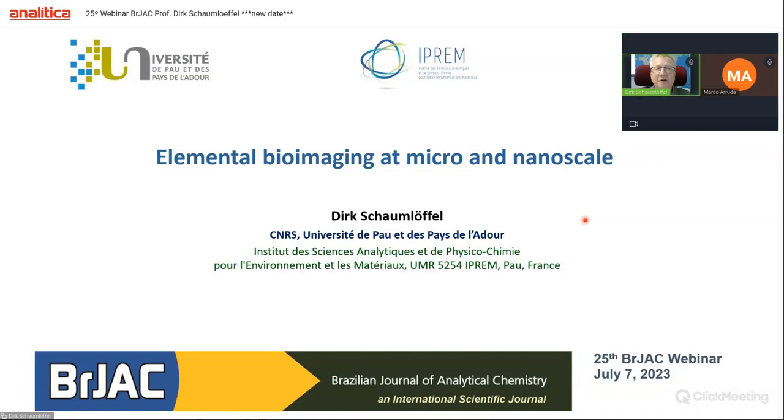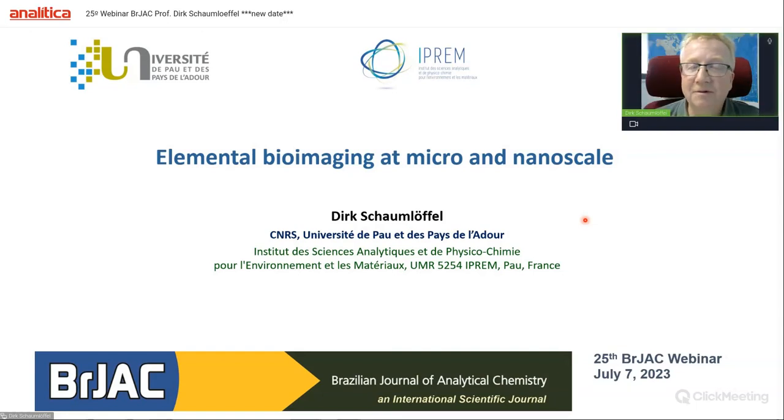Heard from the introduction from Marco, so related to my CV, I'm really working a lot on trace elements. Today I want to talk about element or trace element bioimaging at micro and nanoscale.